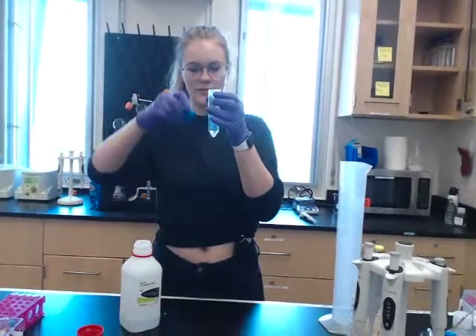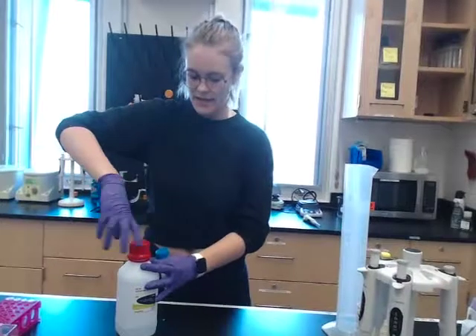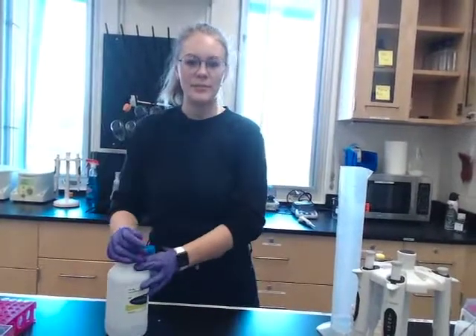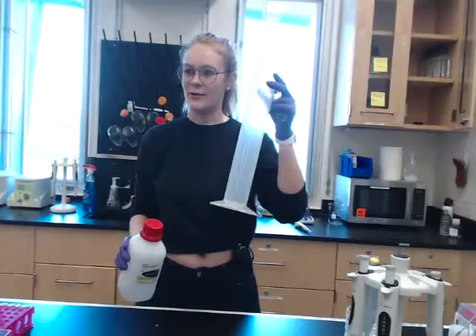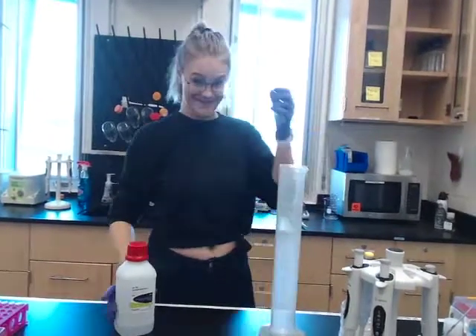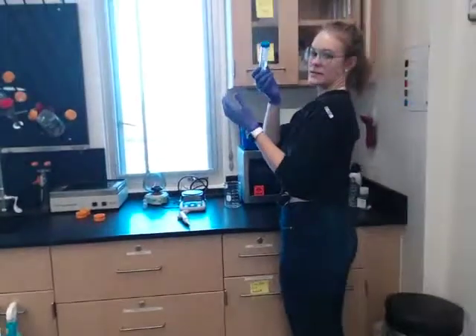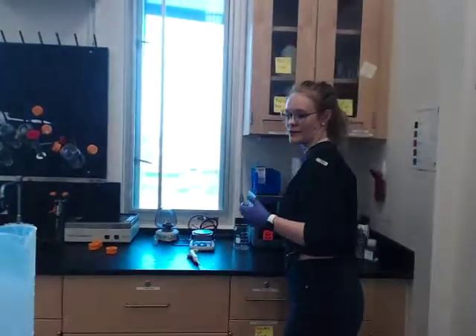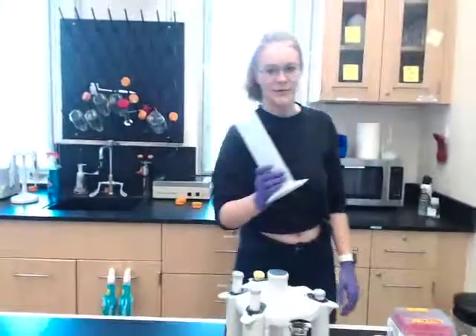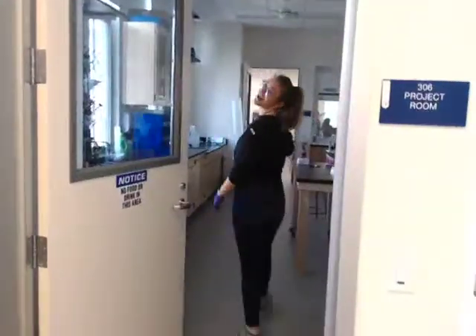So now I have my nice 20 ml of the aliquot. I'll tighten it up, tighten this guy up. And I'm just going to put this in the cupboard, this on its shelf, and this guy back by the DI water. This guy goes here — TAE stock, right there. Close the cupboard when you're done. And this will go back where I was 5 minutes ago by the DI water.